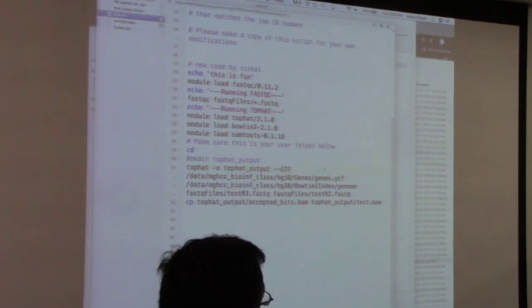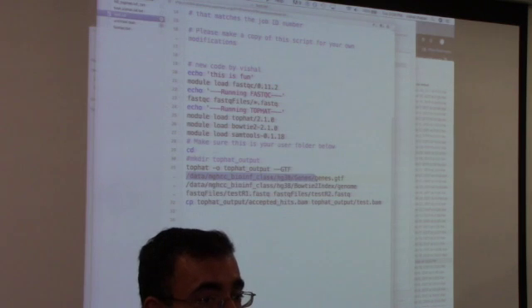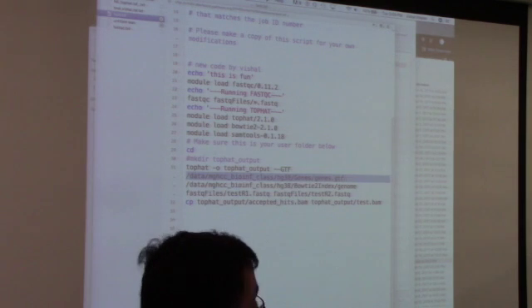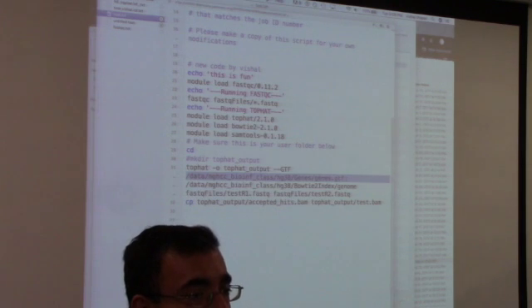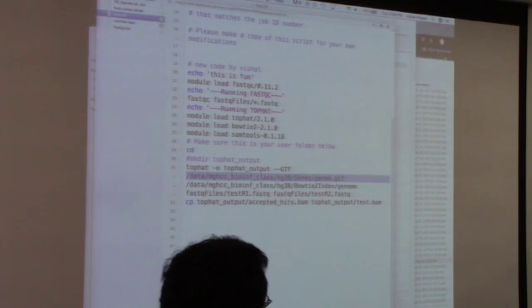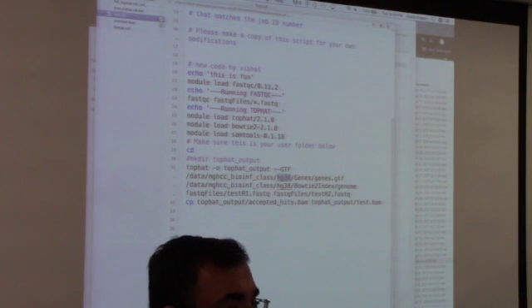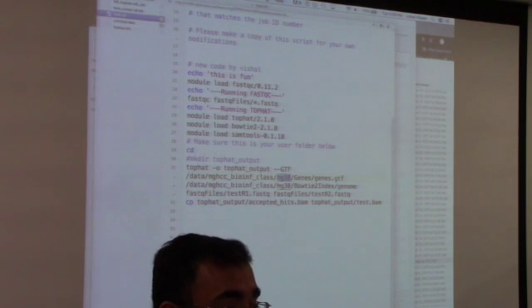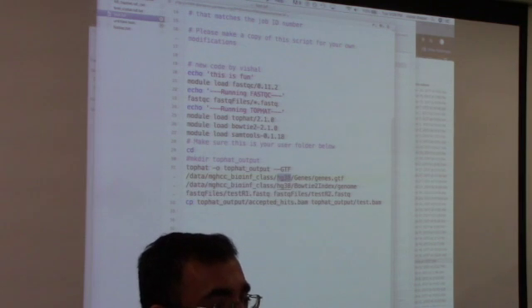This is the absolute path where it is. If you were to try to go to this directory, it'll say permission denied, because as of now, you don't have permissions in this directory. I made it that way for a reason, because every time I gave the previous groups permission, they would go in and delete stuff. So I decided not to give you permission. What we're going to do instead is I'm going to copy this HG38 directory into the temp folder that we created on Iris1 node 2, and then you are going to copy the HG38 directory from the temp directory to your home directory.